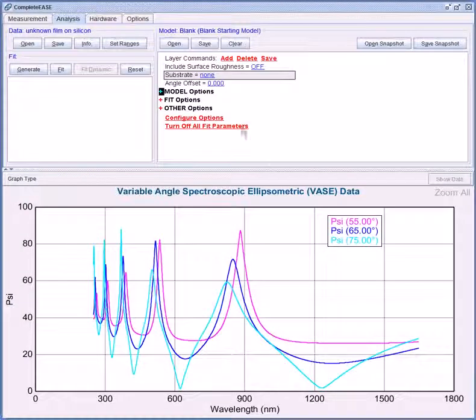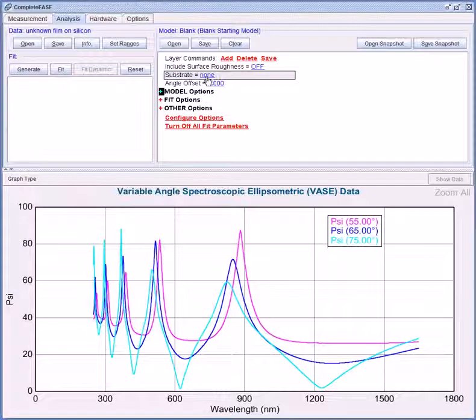We know that the substrate is silicon so we can enter silicon optical properties for the substrate. Click on the blue letters none.